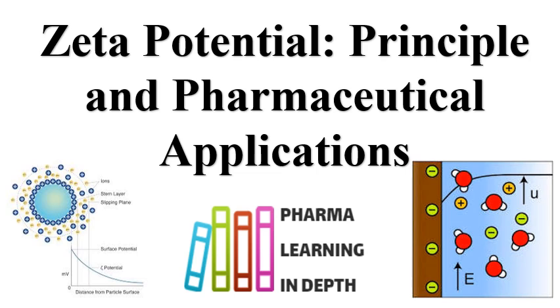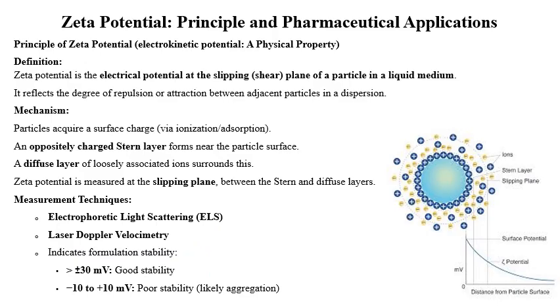The surface of the particle has some charges, and because of those charges there is attraction of the opposite charge, and then the layer of charge adjacent to the particle and the layer of the charge opposite to that charge develops. So electrokinetic differences are there.